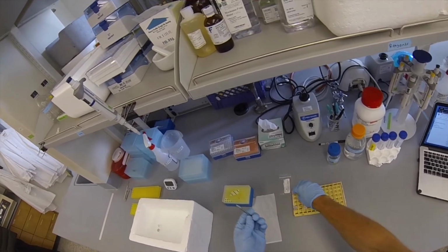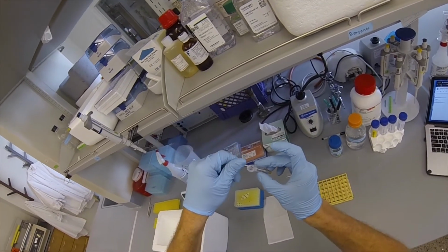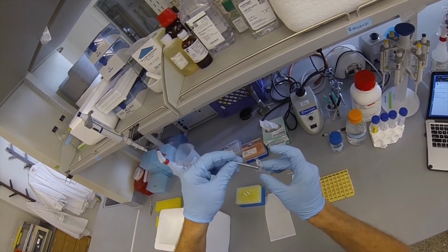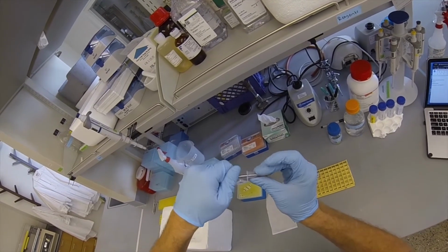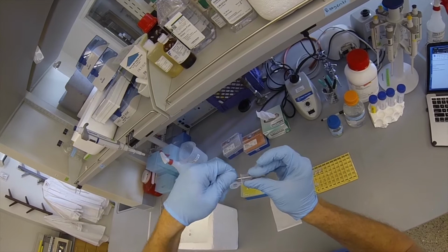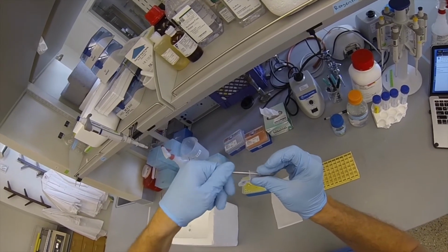Now you are ready to start grinding the tissue samples using the tissue homogenizer. Place the tissue homogenizer in the test tube and make 10 twisting motions, grinding the tissue down. Make sure the cells are fully disrupted before moving on to the next sample.